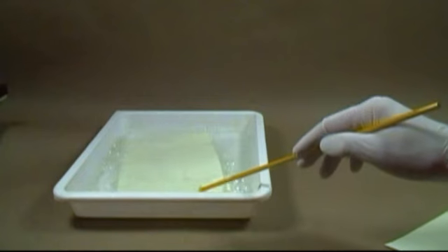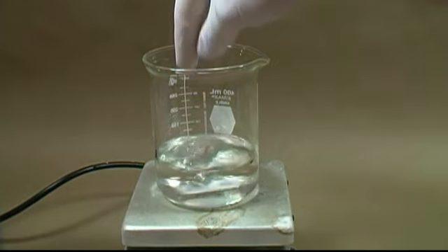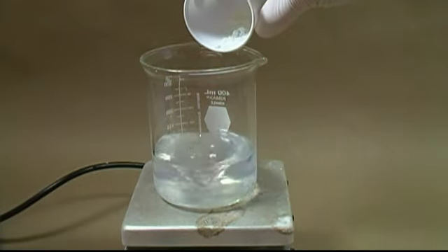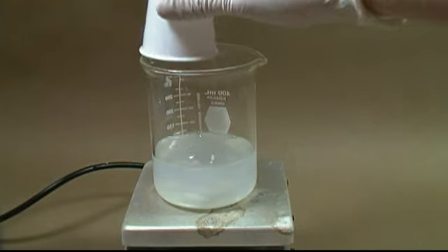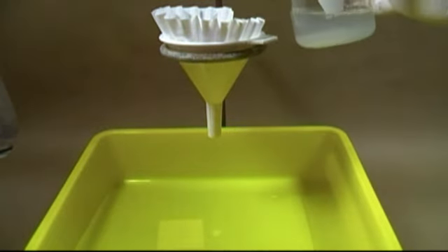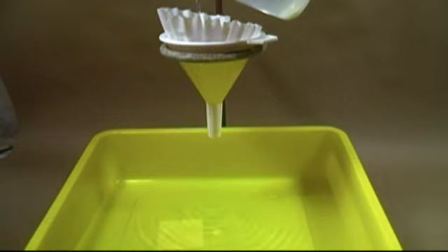While that is soaking we can build our next bath. Place the beaker on a stir plate and add the stir rod. Add 100 milliliters of distilled water and then add 10 grams of silver nitrate. Stir until fully dissolved. Now set up again for gravity filtration and filter your solution into your second tray filled with enough distilled water to submerge your paper. Move the tray around and mix — your second bath is now ready.